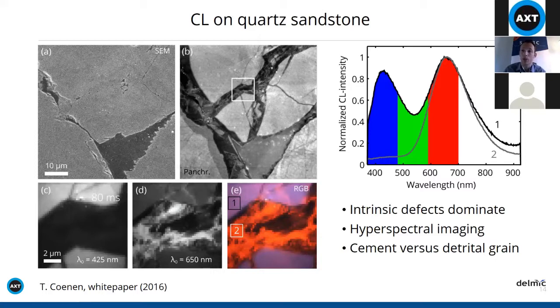Particularly if you also look at fractures. Sometimes there are fractures in the crystals because there's a tectonic movement, for example, and this you can time with respect to the cement infilling, because you can see whether the crack goes through the cement or not. And these types of things you can see really in these measurements.